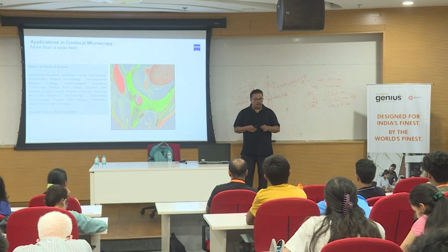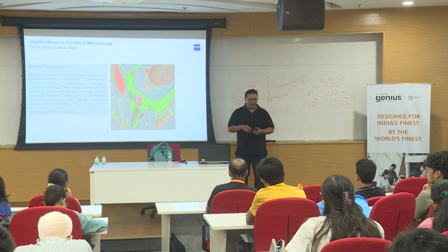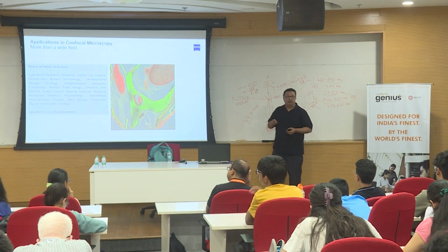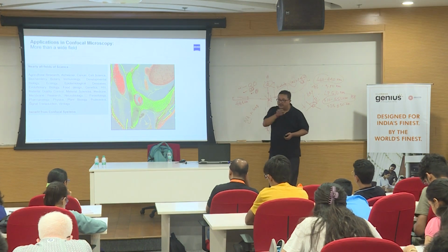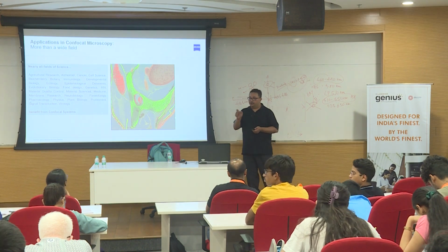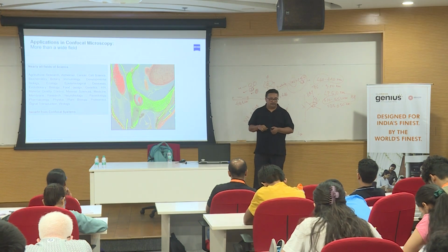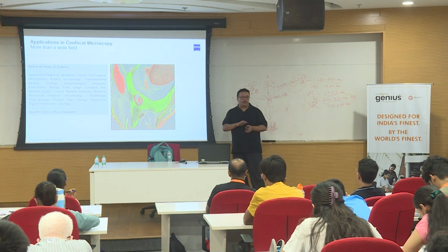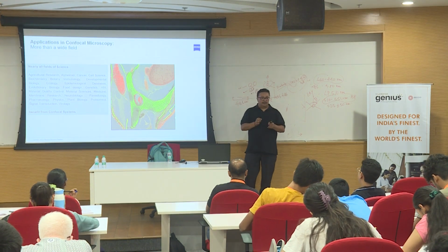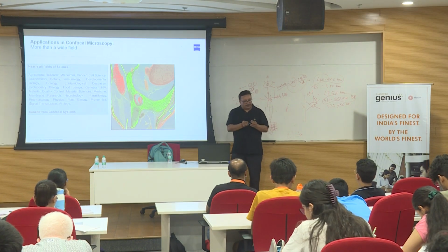With a confocal, you can do quantitative colocalization, because the same sample will be acquired at the same focal plane without any out of focus haze information. You will be able to quantify the intensity values of green minus the background, the intensity value of red minus the background, and you can easily quantify the two signals and understand the colocalization aspect in terms of numbers. So your confocal is not for doing pretty images only, it's for data analysis also, for acquiring data with numbers. What is important is not just beautiful images, but the numbers associated with them.